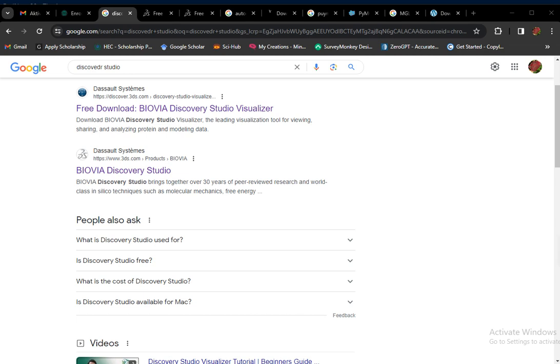Assalamu alaikum, welcome back to another exciting video. In this video we will learn how to work on AutoDock Vina. To work on AutoDock Vina there are some requirements — we need some software, so first of all we download Discovery Studio.